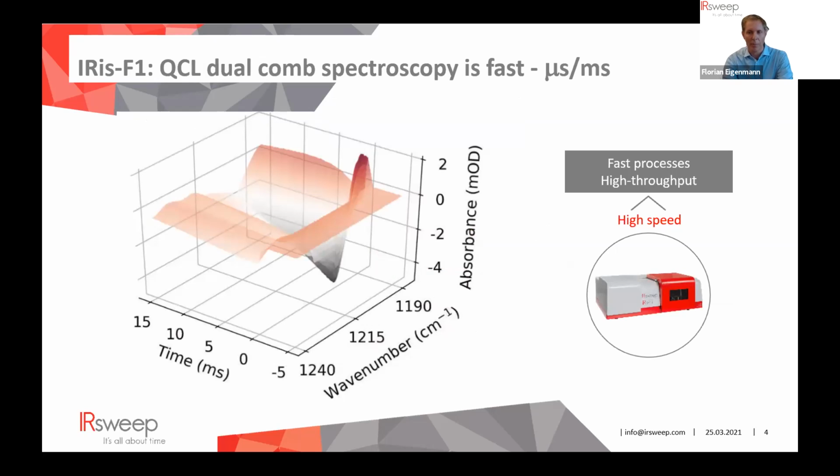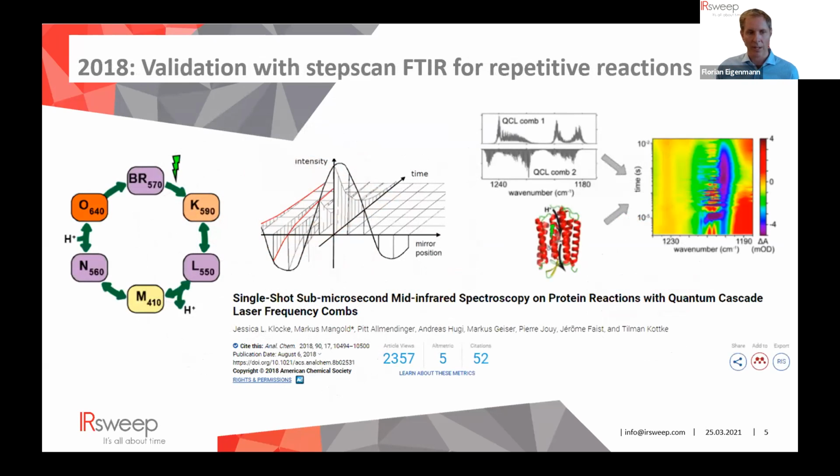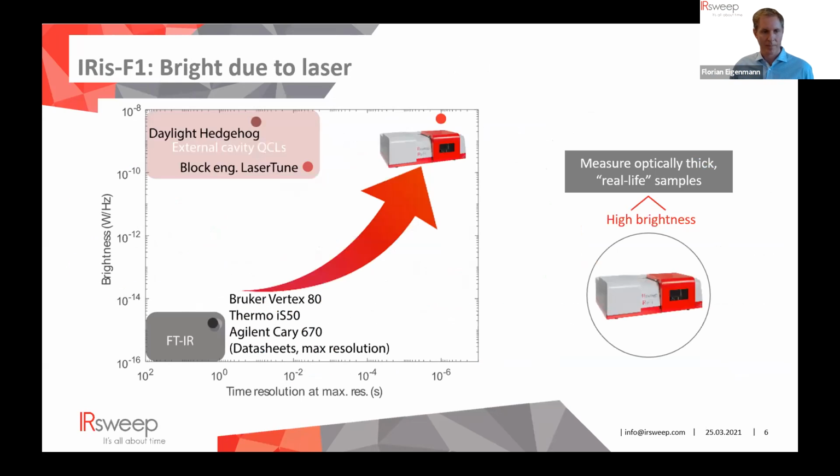That was already published early on with bacteriorhodopsin measurements. And this was published in 2018. It was validated with step-scan FTIR for repetitive reactions, together with Tilman Kottke and Jérôme Faist.